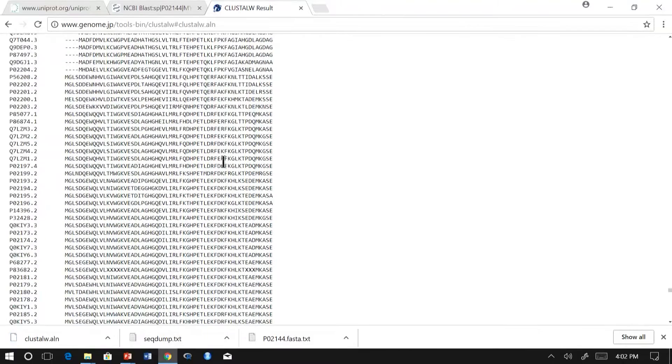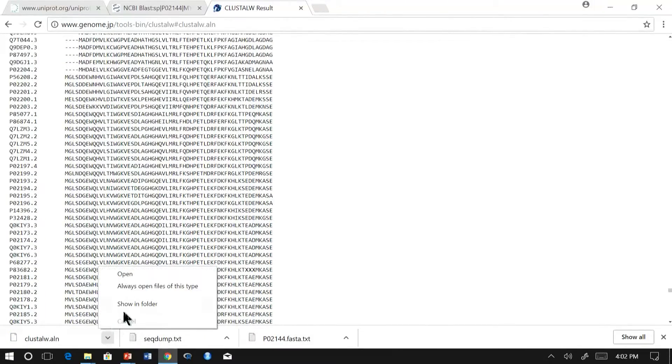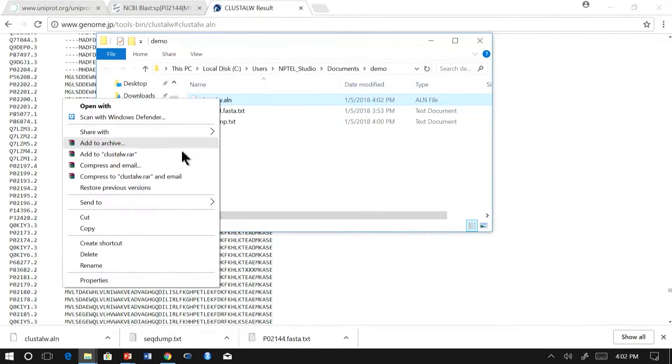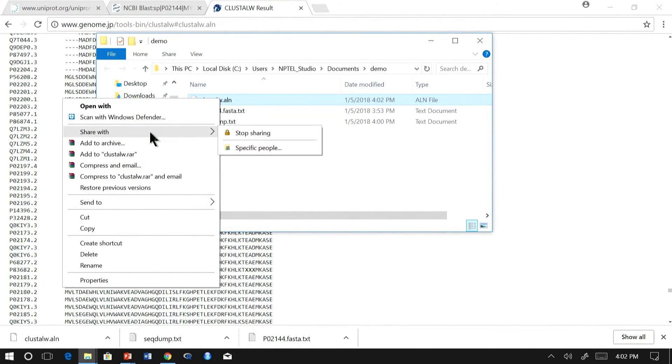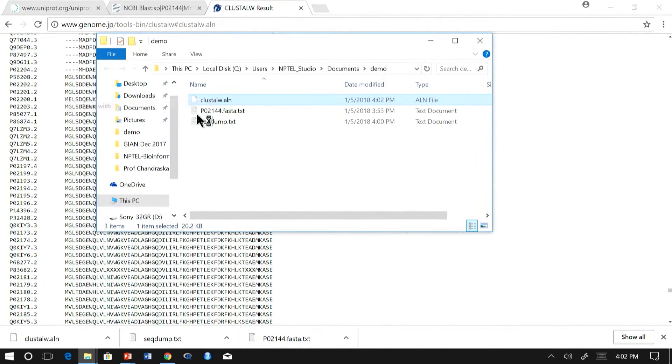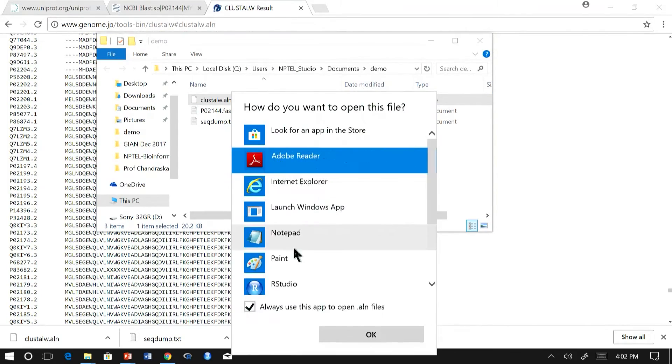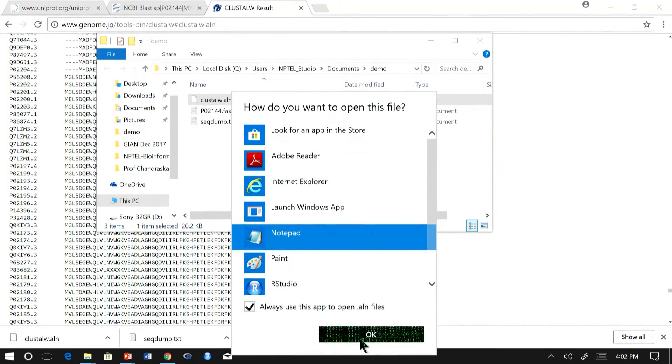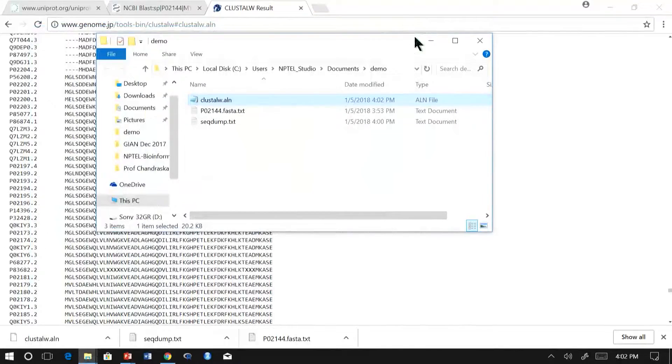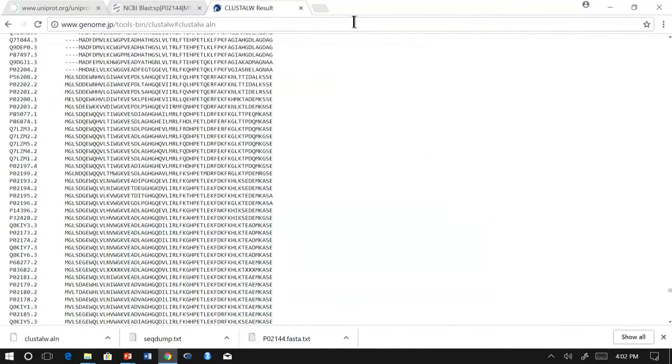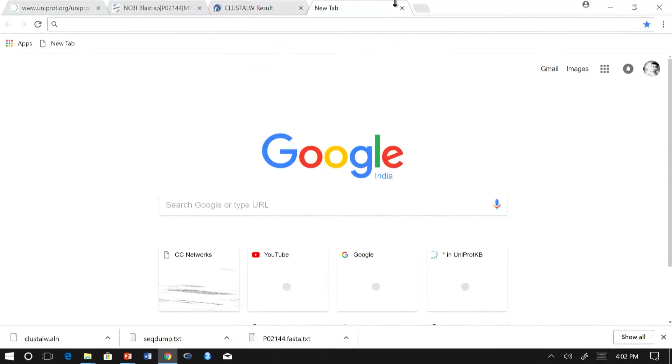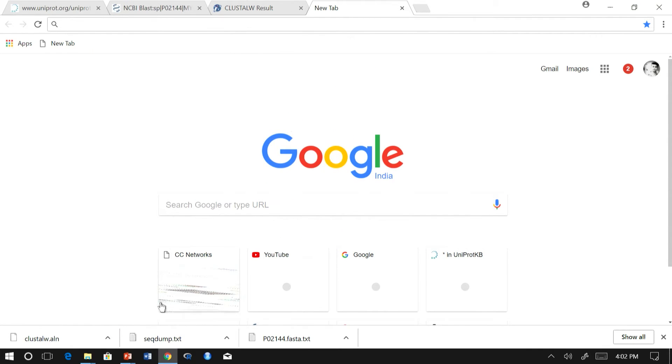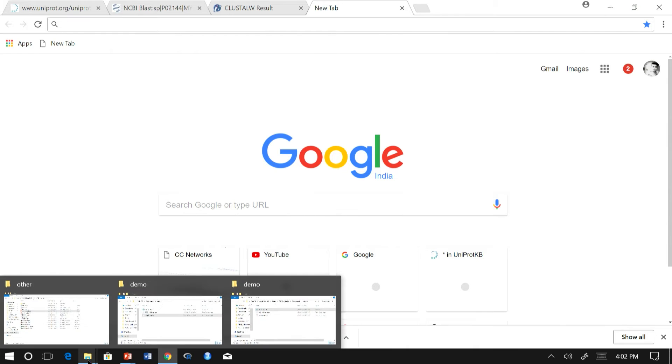Now we have got the alignment, multiple sequence alignment. We will use AL2CO to obtain the conservation score.